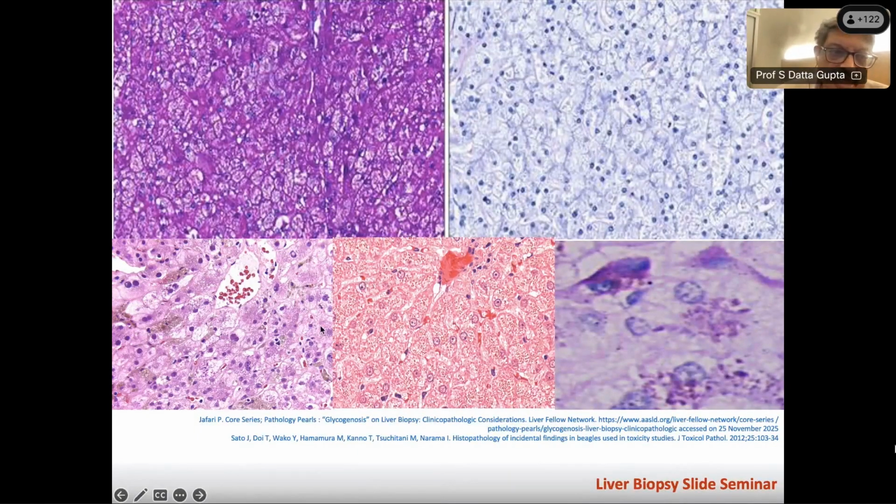It's all gone. Another thing you'll find in hepatocytes, from childhood onwards, is this brownish yellow pigment, mainly in the central area or zone 3 around the central vein, and that pigment is known as lipofuscin, or wear and tear pigment, or ceroid pigment.